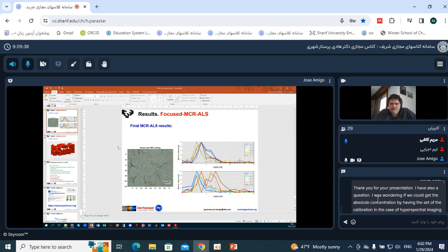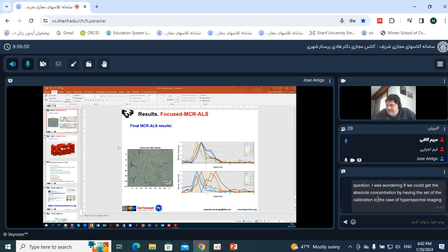Okay, another question. Thank you for your presentation. I have also a question. I was wondering if we could get the absolute concentration by having a set of calibration in the case of hyperspectral imaging.